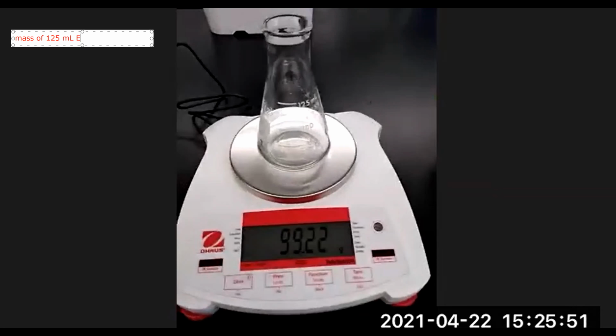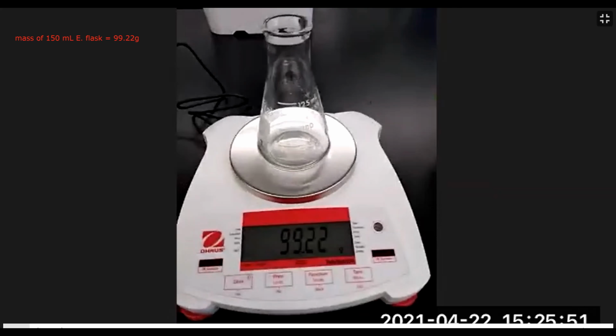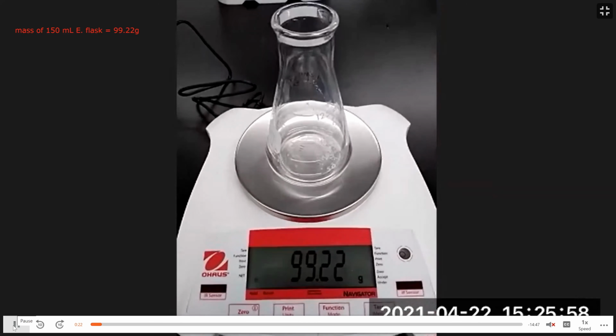Actually, I think it's a 150 milliliter Erlenmeyer flask. That's what I was thinking. This is 99.2 grams. So it's very important you record the mass of the empty Erlenmeyer flask.